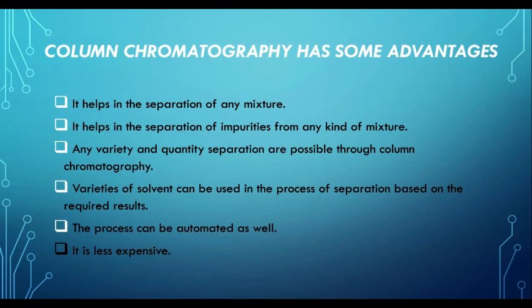Advantages. It helps in the separation of any mixture and impurities from any kind of mixture. Any variety and quantity separation are possible. A variety of solvents can be used in the process of separation. The process can be automated and it is less expensive.